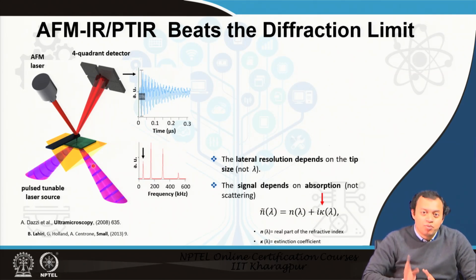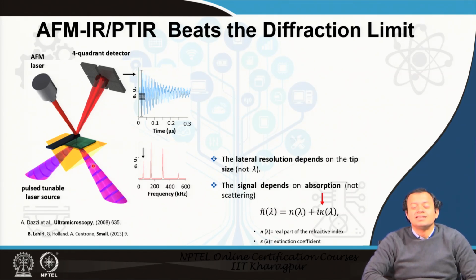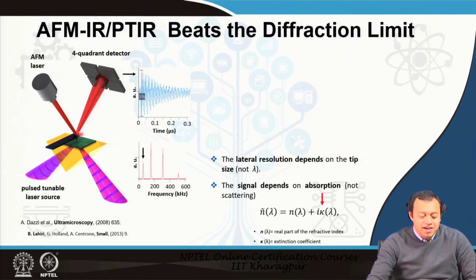Okay. Pause, rewind and then try to say what I just said. It is very, very easy, it is very, very simple technique. The cantilever is moving in x and y direction.